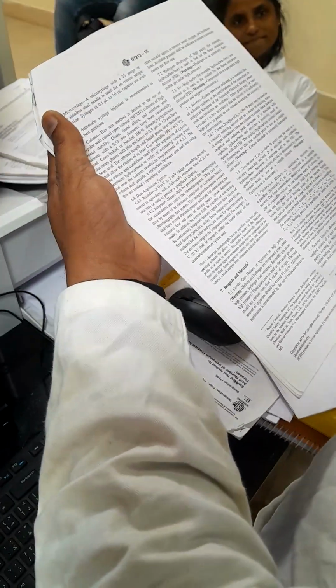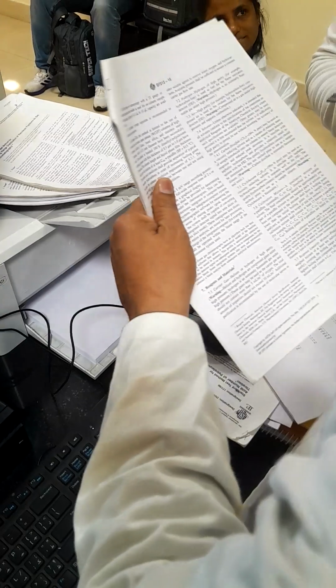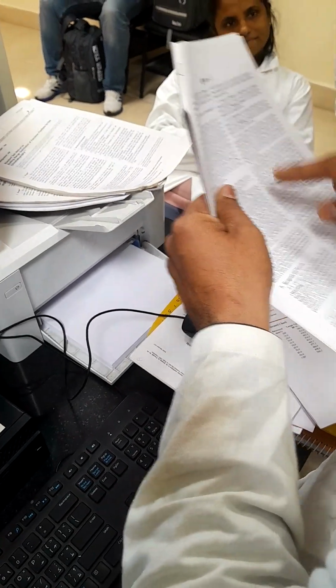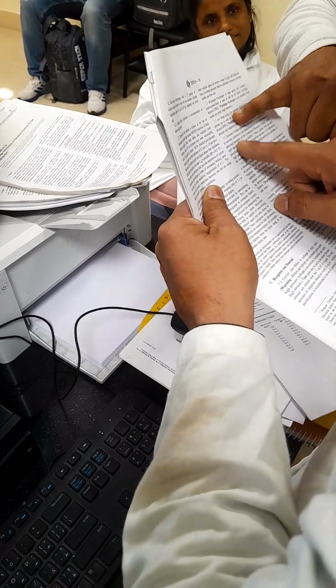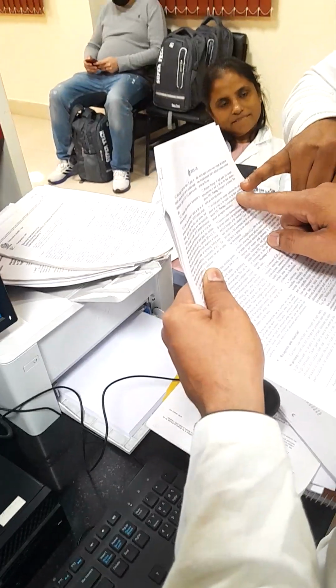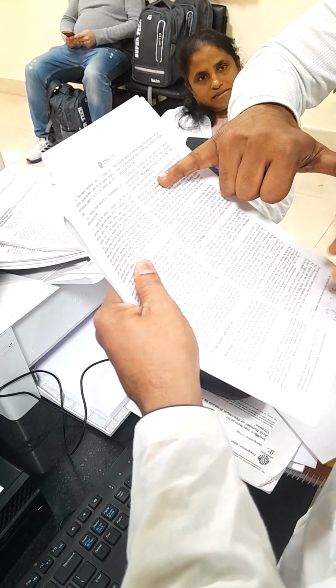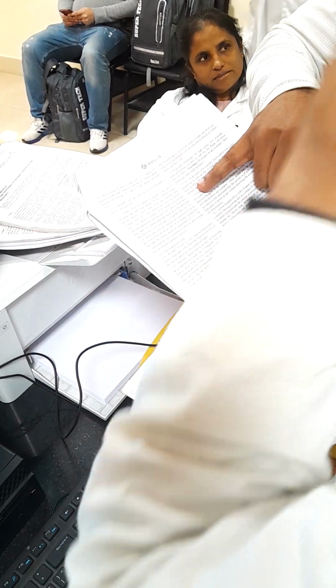So yes, you have helium or hydrogen. Because from my understanding, the air would oxidize the column, especially at that temperature. We are getting air also, na? You can mention carrier gas here also. High purity oxidant is also used at the detector point. Compressed air is a gas under high pressure and supports combustion. The air is for the FID detector.